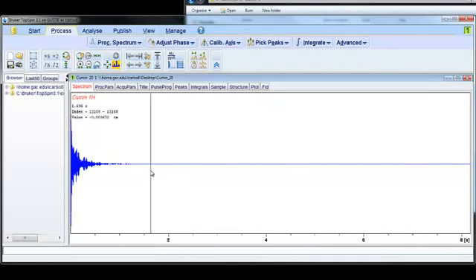It's important to know that although this process is important and it does improve the signal-to-noise ratio, it actually does also decrease the resolution of your spectrum a little bit. So it's just important to know that trade-off.